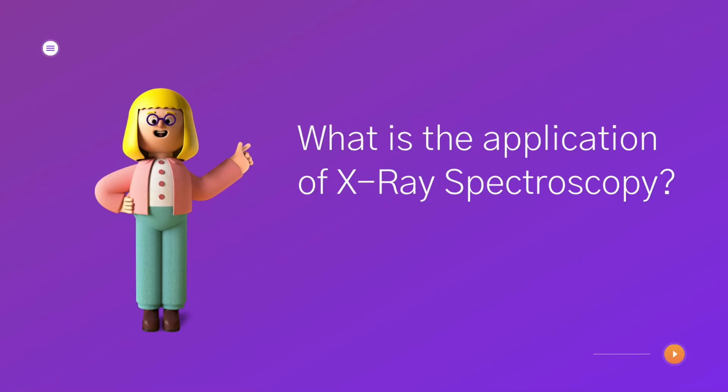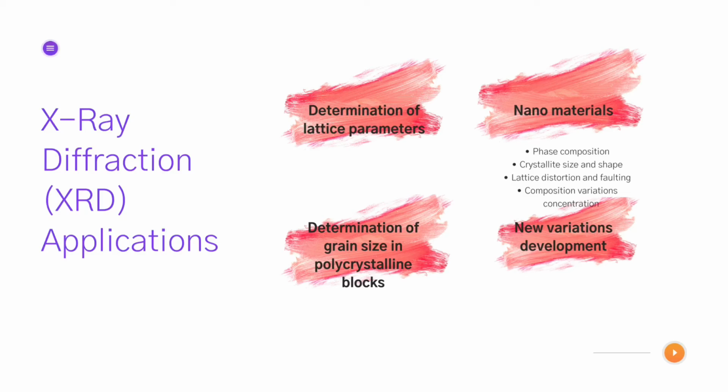Let's continue with the application of X-ray spectroscopy. X-ray diffraction XRD applications: determination of lattice parameters, the determination of grain size in polycrystalline blocks, nanomaterials with more detail on phase composition, crystallite size and shape, lattice distortion and faulting, composition variations, concentration, and lastly, new variation development.